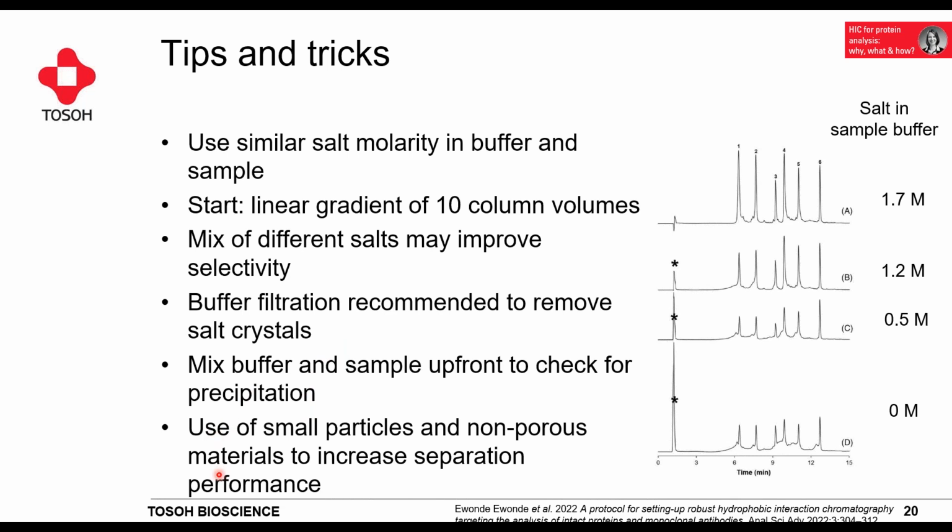Last but not least, this is also something we learned. If we use small particles and non-porous materials, we can increase the separation performance due to the low mass transfer resistance we see in non-porous materials.